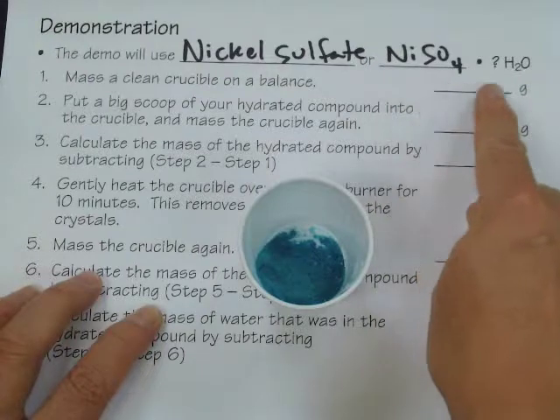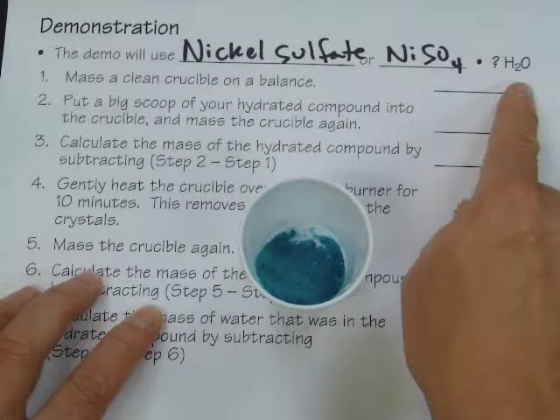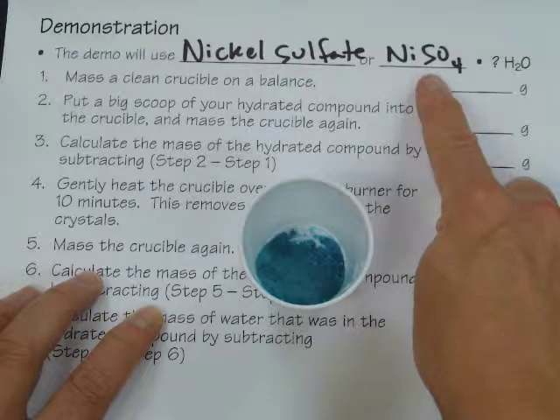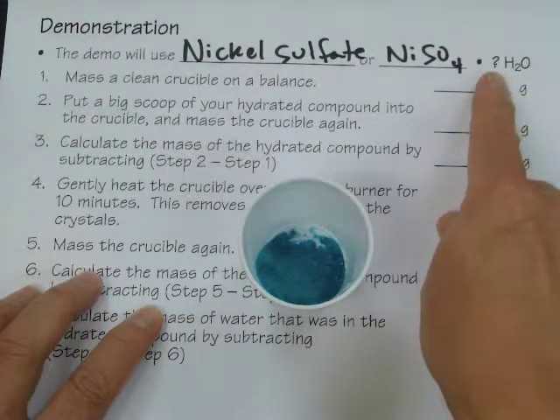We're not going to break down this compound all the way to its elements. That's extremely difficult to do. Instead, we're going to count how many parts there are for each one nickel sulfate crystal, or part of the substance, how many parts are water. And we'll try to find out what the question mark is, what the coefficient is for that formula.